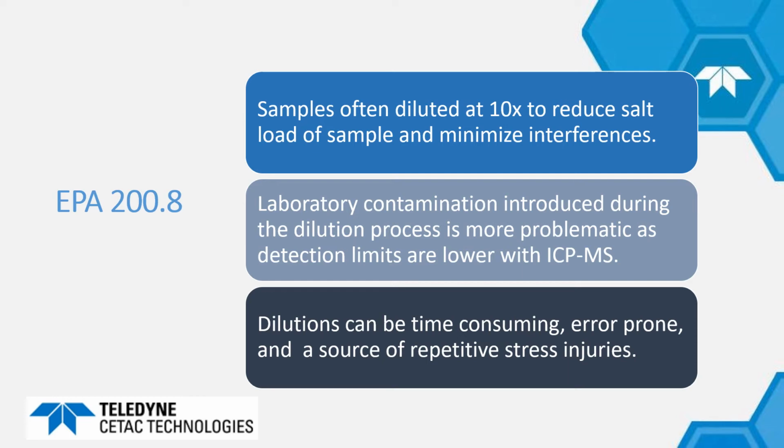However, it can also lead to laboratory contamination being introduced during the dilution step. And because of the low detection limits with ICP-MS, any contamination that comes from the process becomes even more problematic.